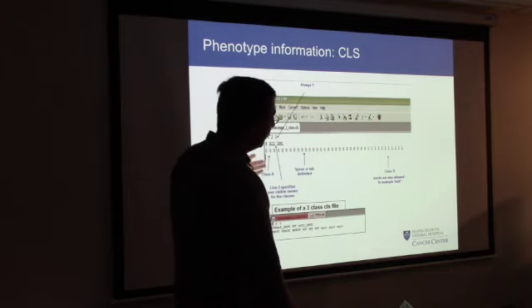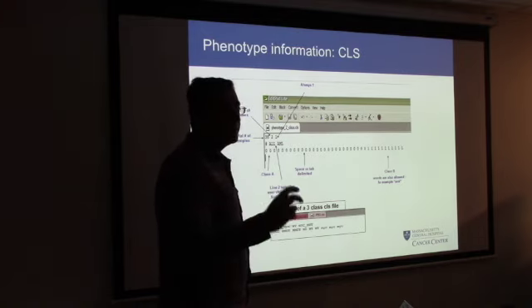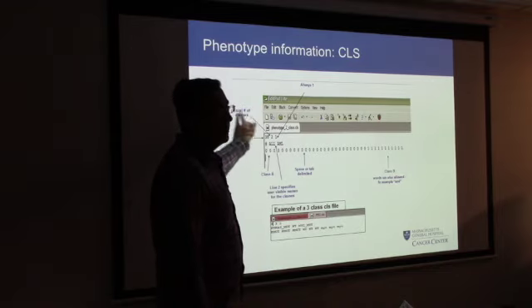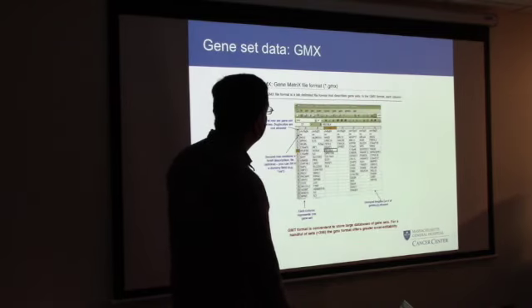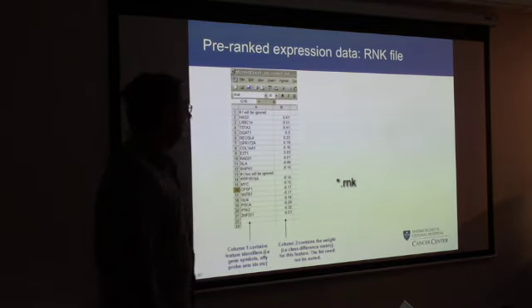This is a descriptor file. Again, you're not doing this, but remember we have those in RNA-seq: a file that tells us what the samples are, and what class and factors they belong to. So this is that factor file for GSEA. But again, we're not doing differential expression, so we don't need this because we're not doing it. Okay, skip. Okay, this part is important.